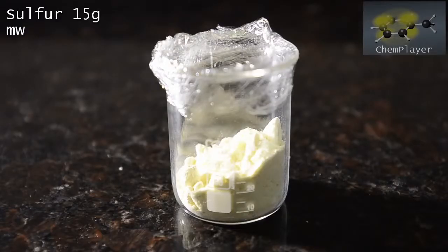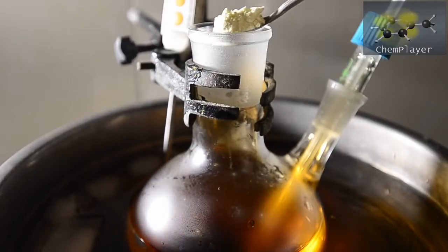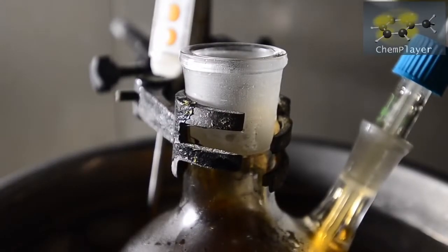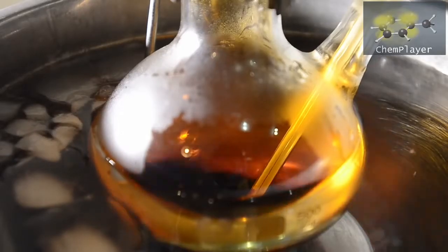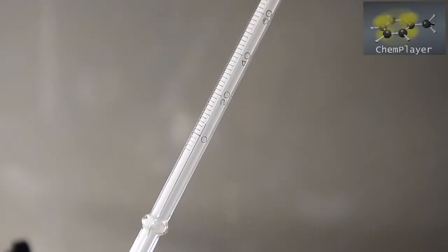Here's our next ingredient. This is 15 grams of dry finely powdered sulfur. Let's add a bit to the flask and see what happens to begin with. We're watching the temperature closely, but there's no change, and no visible change inside the flask. So we keep the addition going. We add all of the sulfur to the flask and there's still no temperature increase. In hindsight we could have probably guessed this, but better to be on the safe side.